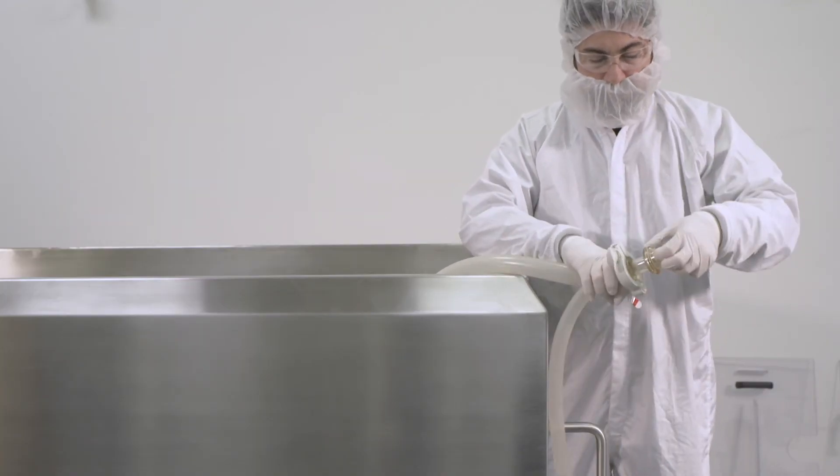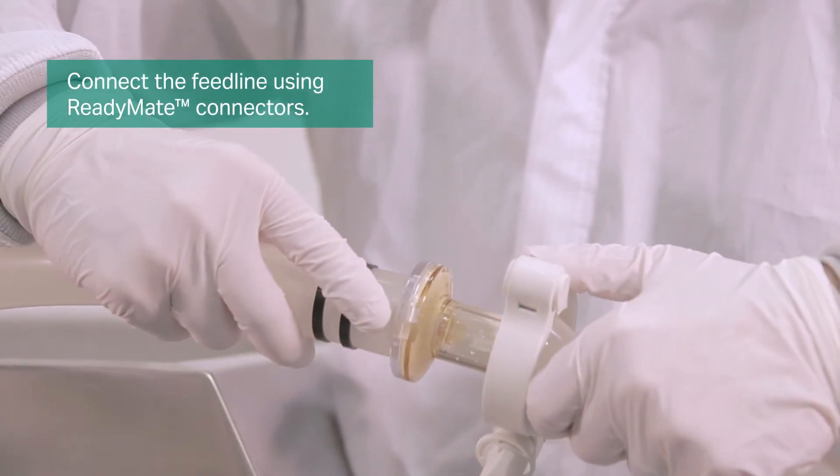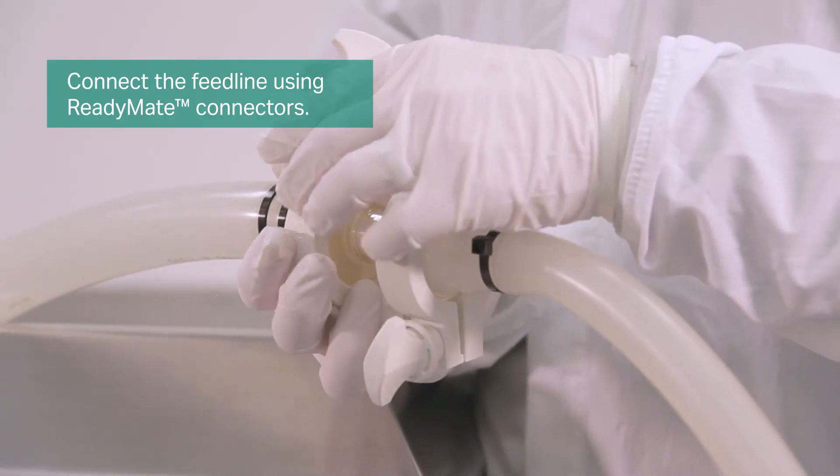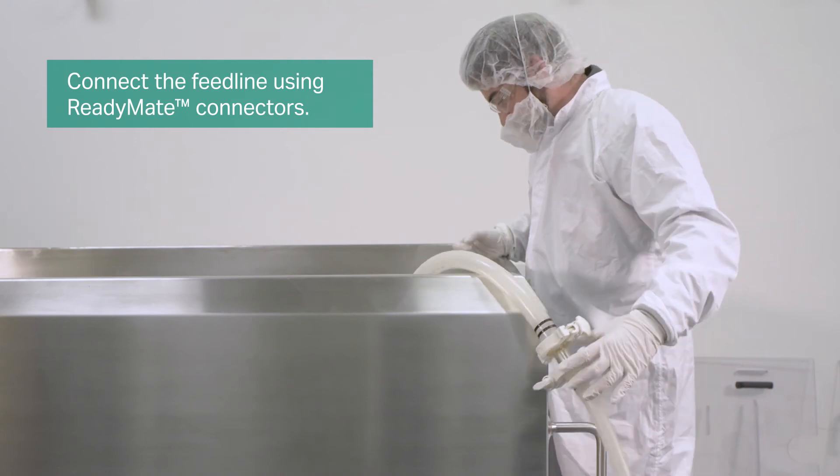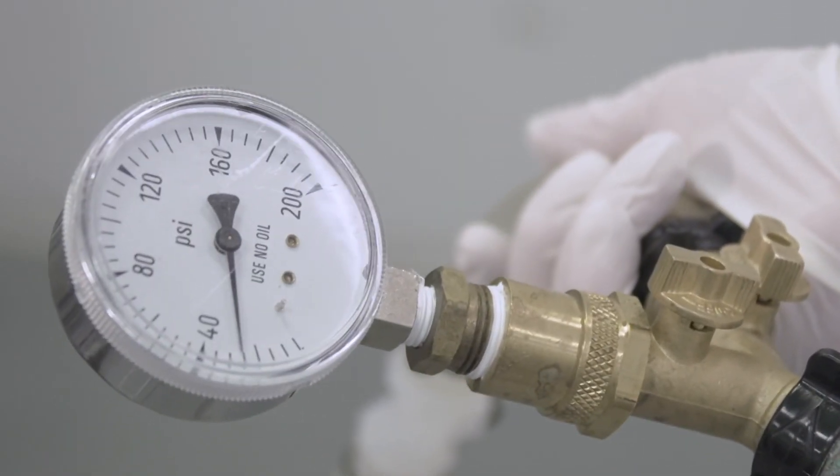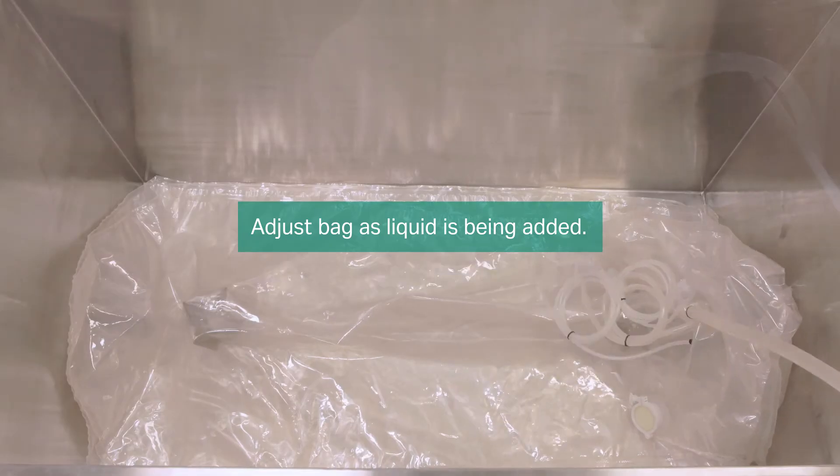Connect the feed line using ReadyMate connectors. Add liquid. Adjust bag as needed during liquid addition.